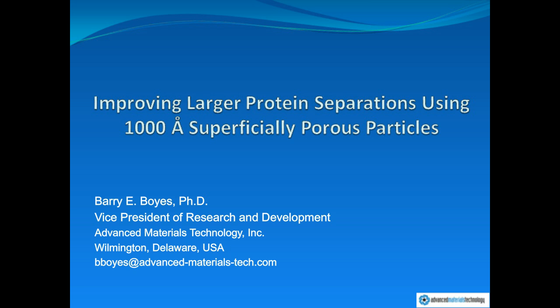Thank you very much, Laura, and thank you for that kind introduction. Hopefully the line we have is good and there's no problem hearing me. So as introduced by Laura, my name is Barry Boyes, and I'll be talking about the use of large pore size superficially porous particles for protein separations, and hopefully I'll convince you that you can carry out separations of particularly large proteins using a new 1,000 angstrom superficially porous particulate material.